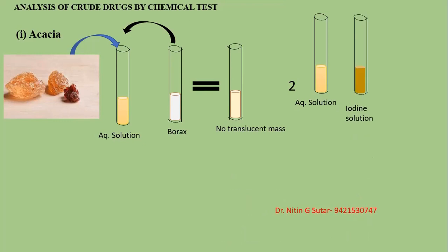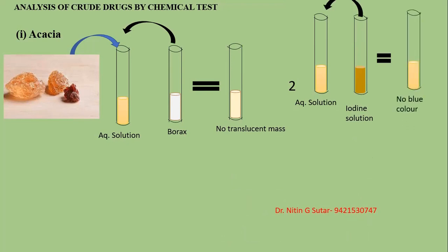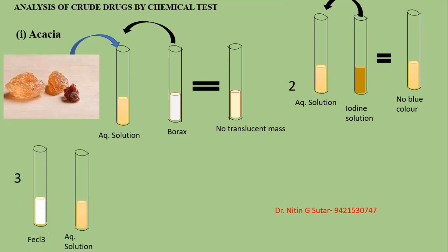When the aqueous solution of acacia is treated with iodine, there is no blue color formation, because starch grains are absent in acacia. Only starch is responsible for giving a blue color with iodine solution. For the next test, add ferric chloride to the aqueous solution of acacia — no bluish-black color is formed. That indicates acacia is present.